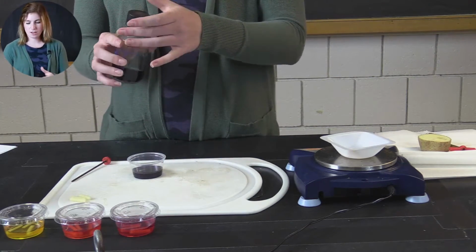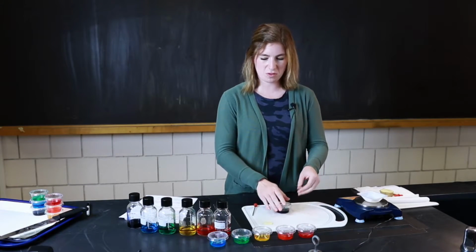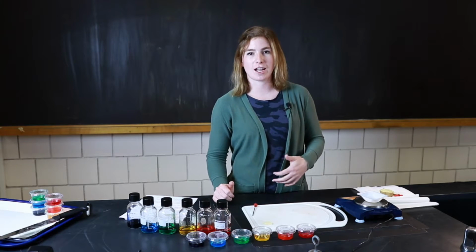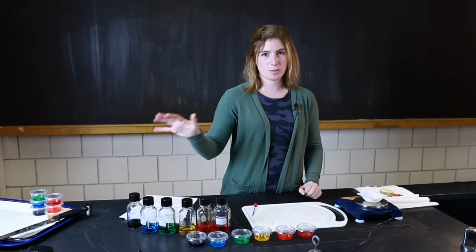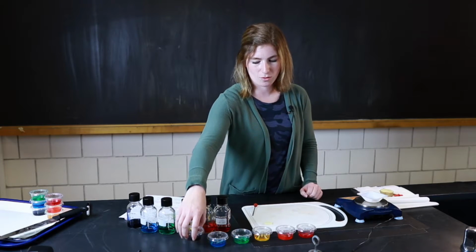All right, so I have my 6 setups now ready to sit overnight. About 24 hours probably would be the best time if you're going to actually do this lab in the future. But what we're going to do is take these ones, put them to the side, and then I'm going to grab the ones that I set up for you yesterday.